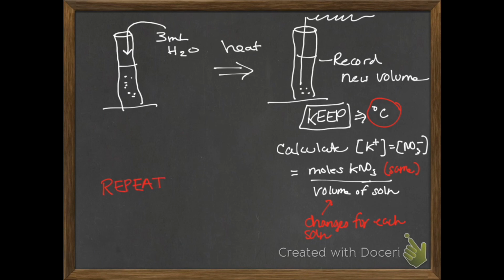Overall, we're repeating the process of dissolving and looking for crystallization a total of 8 times. So we're going to have 8 different data points that we will have to make our van 't Hoff plot to calculate delta H naught and delta S naught.